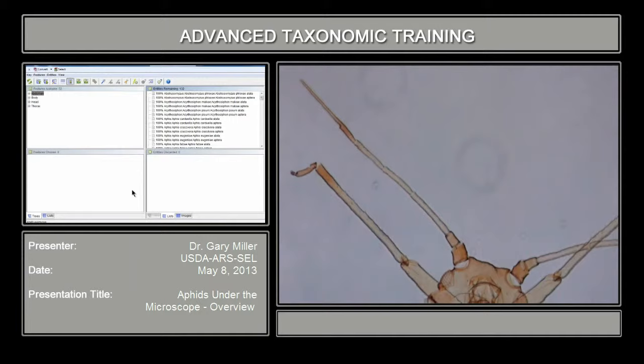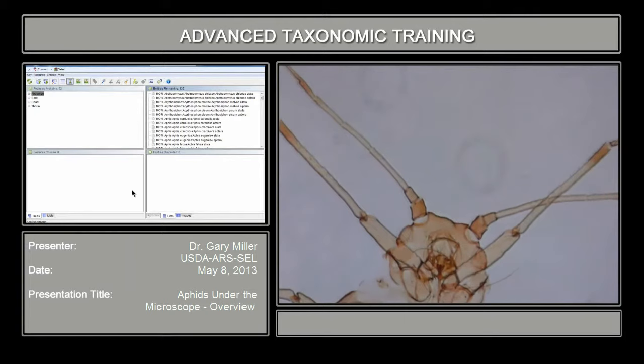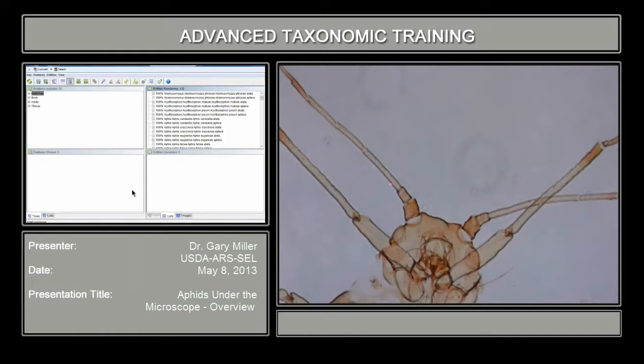There are other structures on the antenna that are important as well. The third antennal segment, shown here, is important because not only are you measuring that segment often, but you're also looking at various structures on it. There are structures called rhinaria — some folks call them sensoria — and these structures are counted often, and in some cases measured. In some keys they even include distribution on that antennal segment, whether they're in a line or scattered.